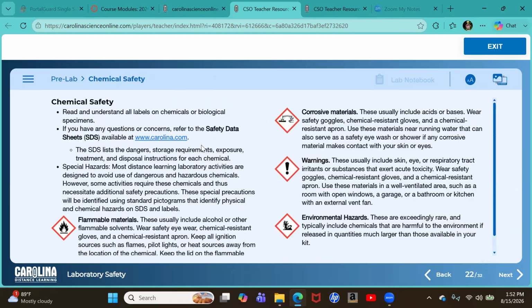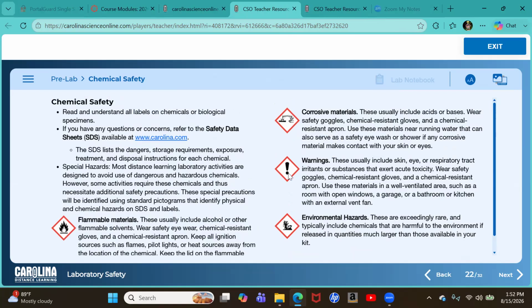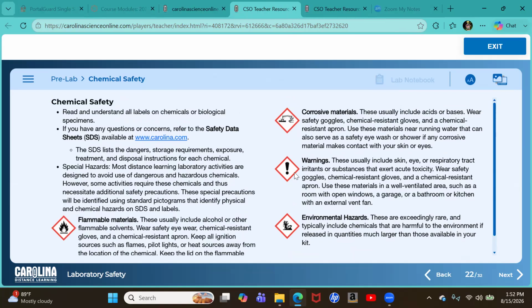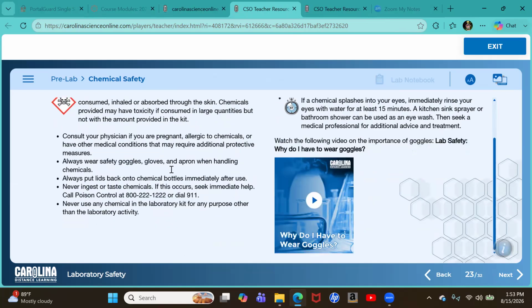Okay. On some of the items in your kit, you may see some of these international safety data sheet symbols here, these hazard worldwide or universal precaution signs. Make sure you're familiar with them. Maybe flammable material, maybe an environmental hazard, a warning, and this one here is one that pertains mostly to our labs. It will be not corrosive per se, but it could be an irritant, the solution that the specimens are in when they arrive in your house. Make sure you're opening that specimen up over a sink and pour that liquid out. Health hazard or toxic, the classic skull and crossbones here, chemicals that are known to be toxic if swallowed or inhaled or absorbed through the skin.